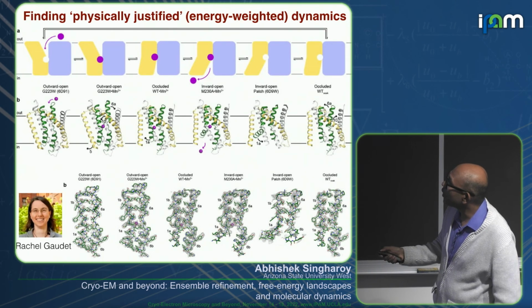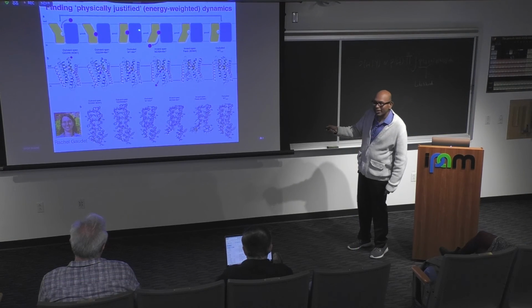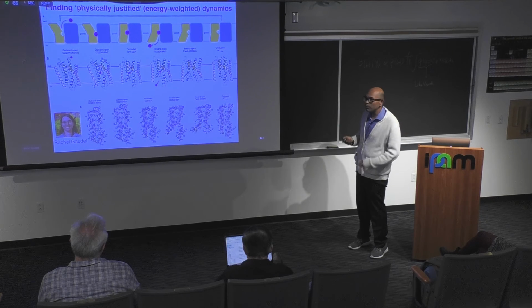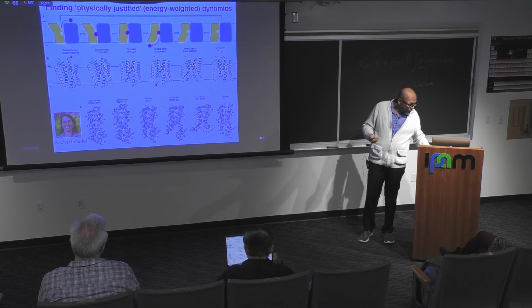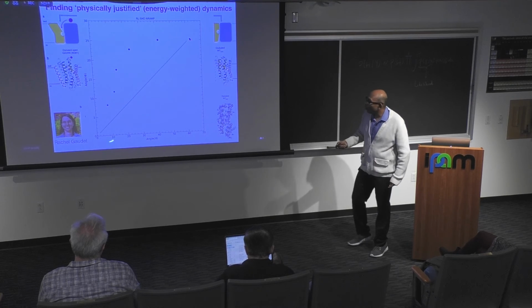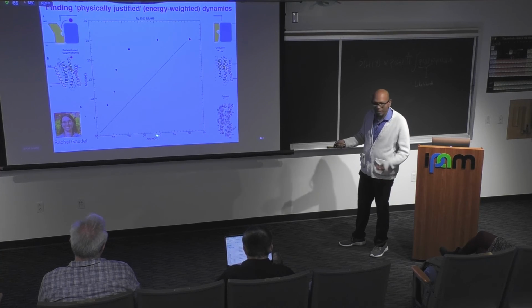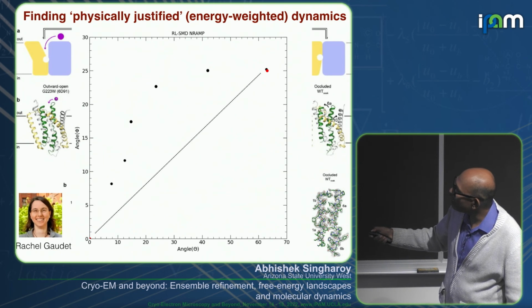So what we did is we said, okay, let's start with experimental data. This is crystallographic data still, of this object here. Let's start with a starting model from here. This is my point A, this is my point B. Can I go from A to B? What's the pathway? Of course, in the two other examples I gave you, I knew the answer because I knew the underlying free energy landscape. Here, I don't know the answer. A straightforward molecular dynamics pulling simulation, for example, will take me here. However, my reinforcement learning algorithm starts from here, takes me on the left, and then brings me down.